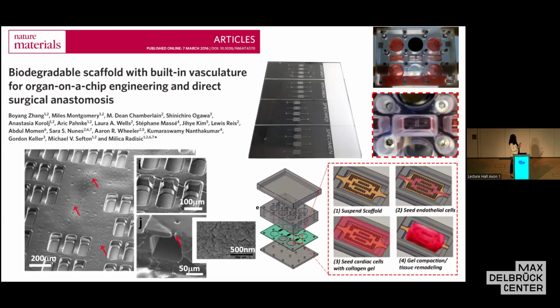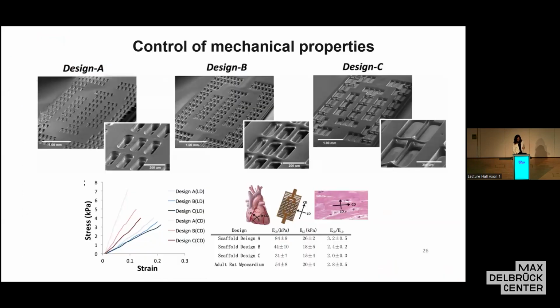And what I usually say about this, especially when I write grant proposals, when you're trying to explain to the reviewer what's the big deal about the approach, is that the polymer gives you mechanical stability. You can pick this structure up, you can handle it. And the cells like hydrogels, and you can basically use any hydrogel or any ECM that cells like, right? If you have hydrogels and they're not anchored to anything, everything will just compact into a sphere. So the polymer here gives you that mechanical stability.